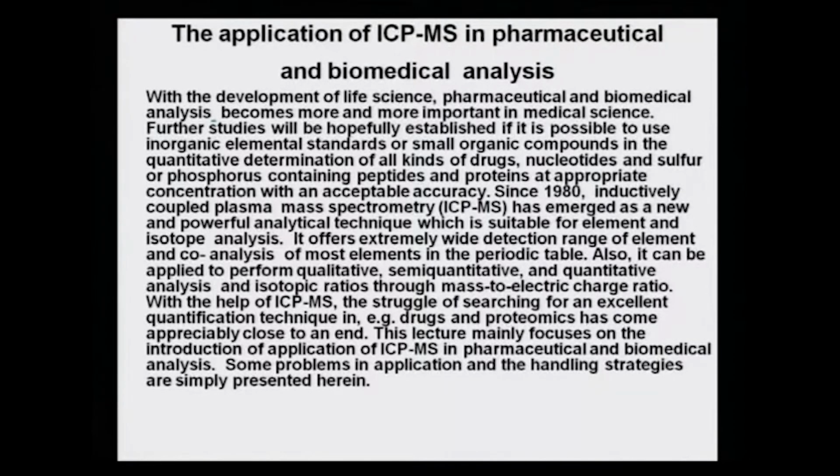So, how can this ICP and the ICP-MS be efficiently used for pharma samples or biomedical samples? What are the manipulations that need to be done? You know the basics of working of ICP and the ICP-MS, but just the way we saw for glass samples, some digestion method had to be a new method. Similarly, how to handle these types of sample, we will take a look at it.